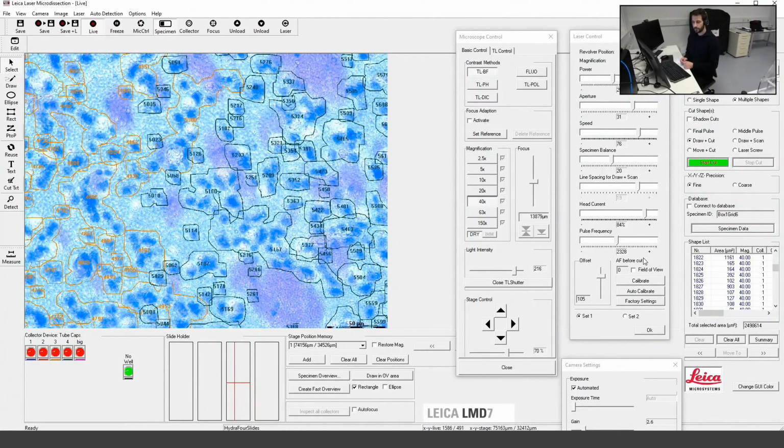You could also tell the system, please put one of these regions of interest into one well of a 96 well plate, so to separate everything. Everything is possible here. Now, you did your import, so you now can cut your dissectates or your regions of interest, and then afterwards do your downstream analysis. And from here, you are done.